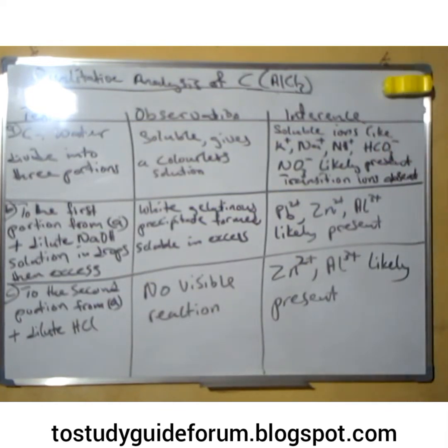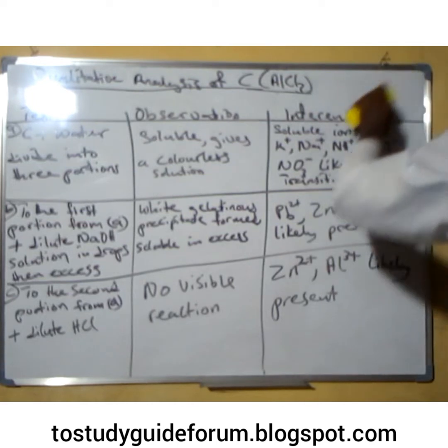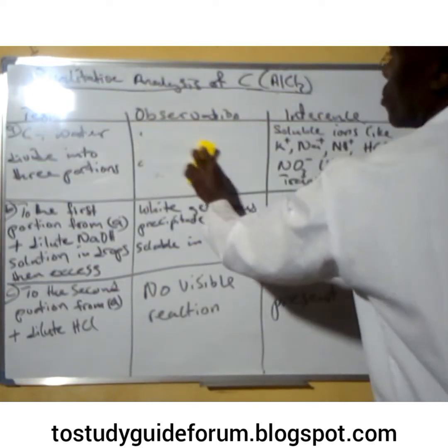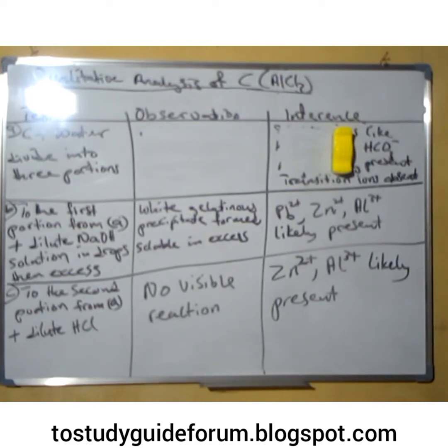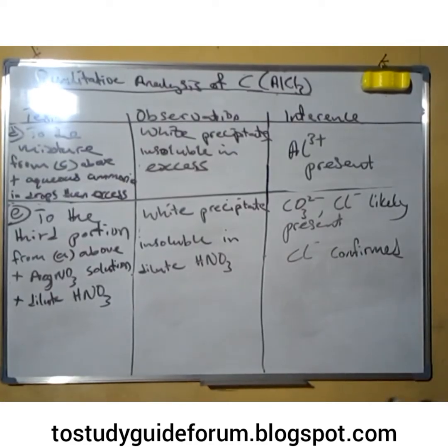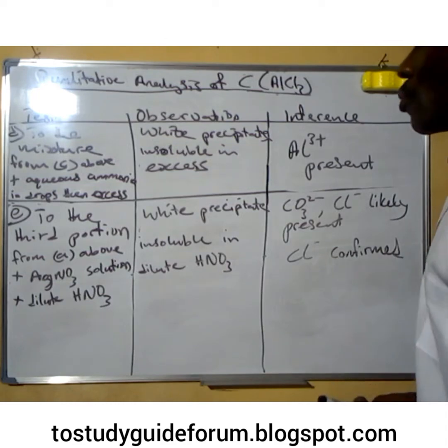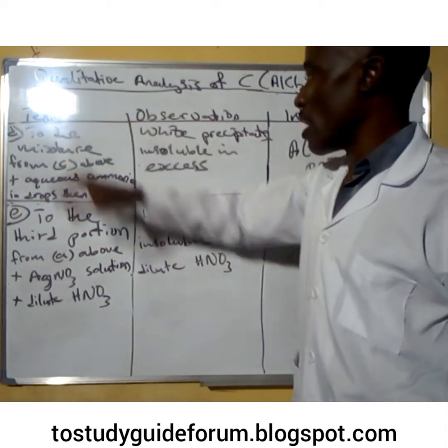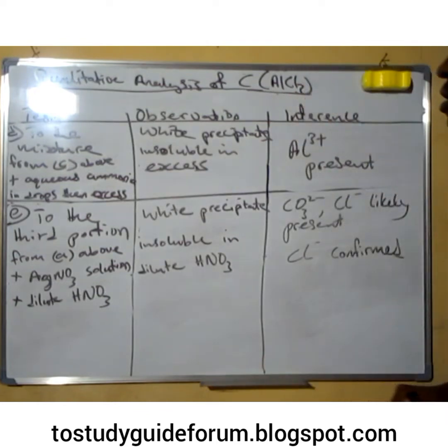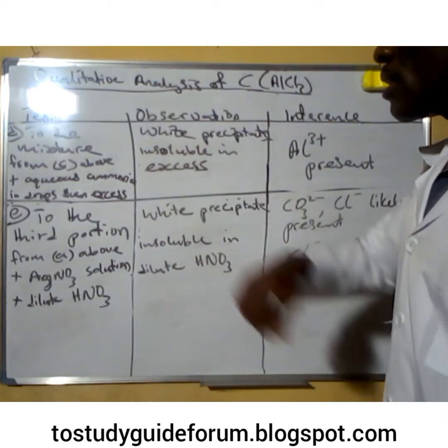So the next thing we are going to do is to look at the mixture we have in C, the one we added hydrochloric acid to.